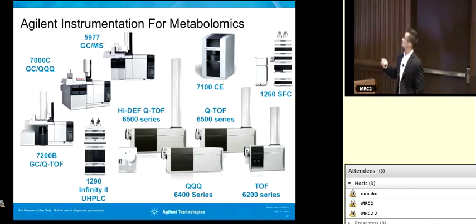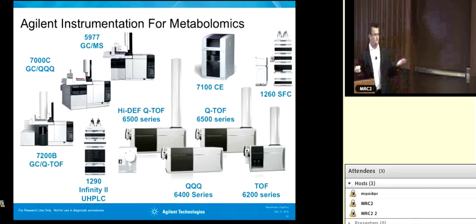But what's interesting is we know that this 2-hydroxyglutarate, or 2-HG, is upregulated. So the question is, is it going through the TCA cycle and being spit out at the alpha-ketoglutarate step, basically? Or is it going by some other pathway? Maybe it's going to the right, maybe it's coming from over here somewhere. Is it an unknown pathway?